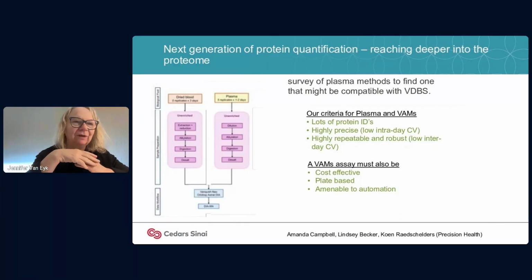So if in normal plasma you see a 5-fold change, you'll pick that up using these nanoparticles, but maybe you won't pick up a 1.25-fold change, right? So there is often a trade-off, but you do get larger numbers. And that's been done in plasma. I'll show you a little bit of data from a company called Seer. Seer, I would say, is the leading company in this field. They have set the gold standard, but they are not inexpensive.